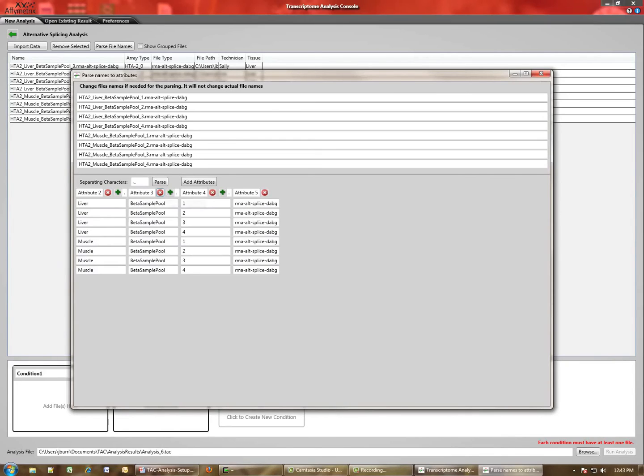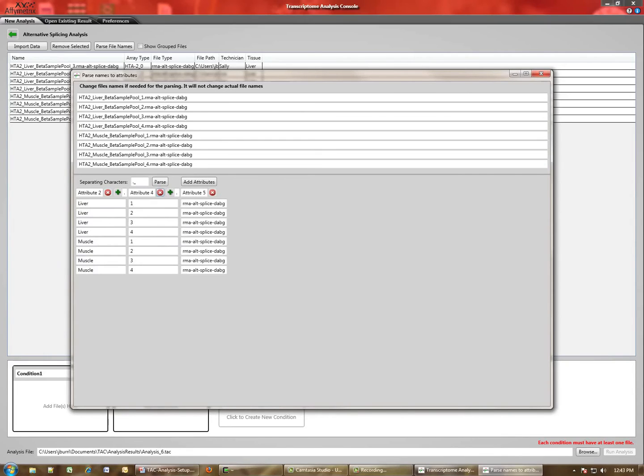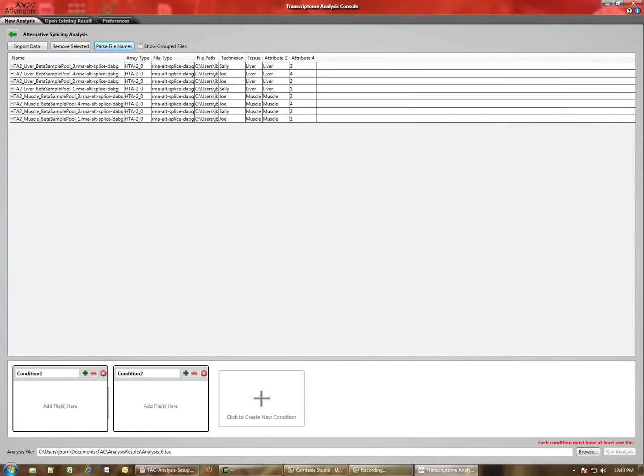You can then choose to select the ones you want. Let's keep attribute two. We'll get rid of three. It's the same. We'll get rid of five. And we'll say Add Attributes. And you can see now in this table, the attributes have been added.